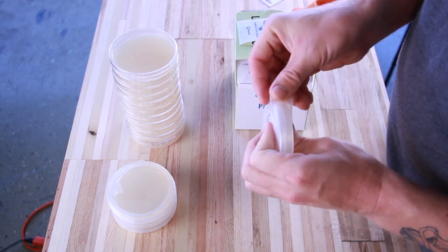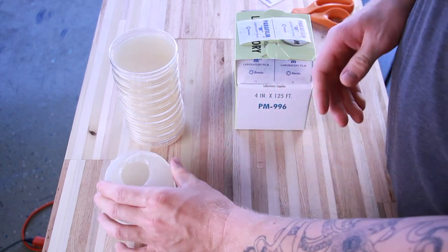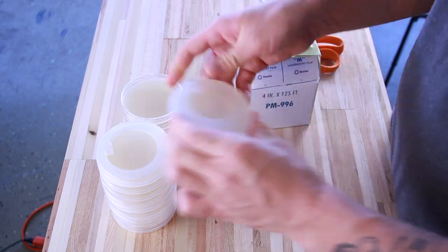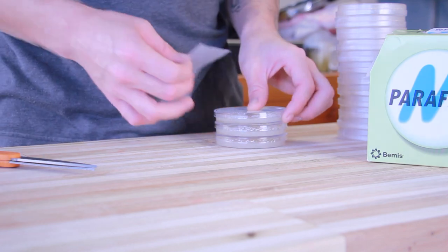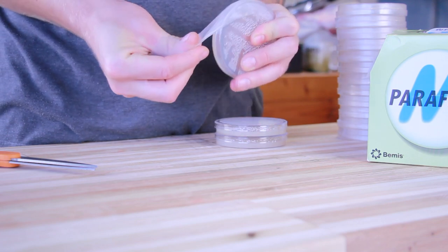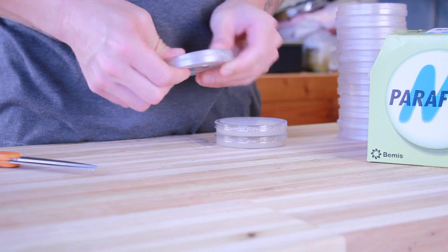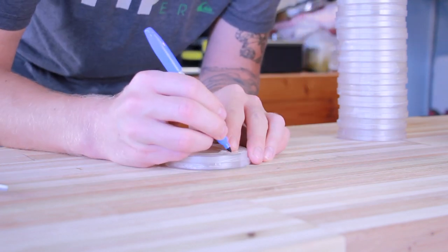After I sealed them with parafilm, I set each of them upside down, and that's to help with condensation. If they're sitting right side up, the condensation forms and then drips down onto the agar. You can see here how much condensation can form at first. The last thing I did was mark each of the petri dishes with the date and the medium used.